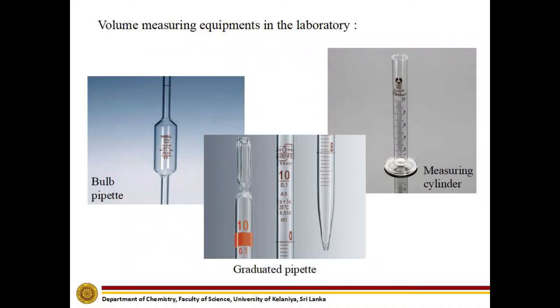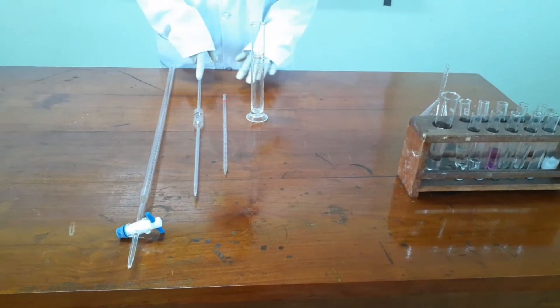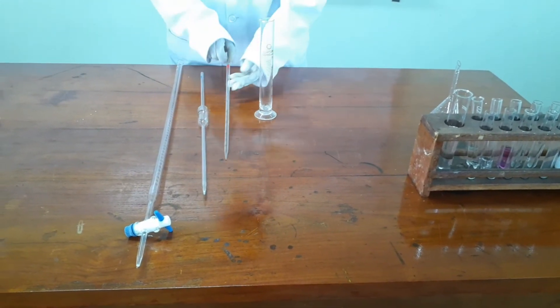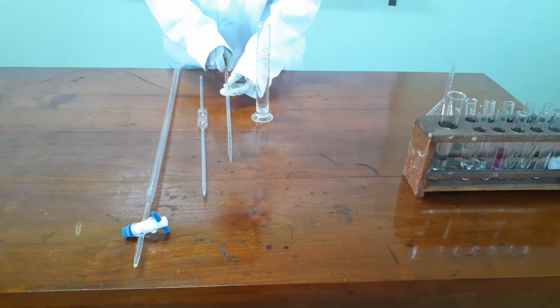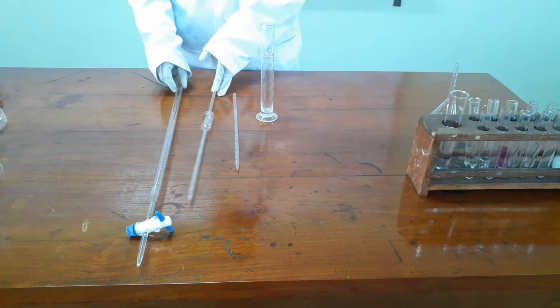Volume measuring equipment that we use in the laboratory. Those are the equipments that we use to measure volumes in a laboratory. This is the measuring cylinder, graduated pipette. This is the ball pipette and this is the burette.